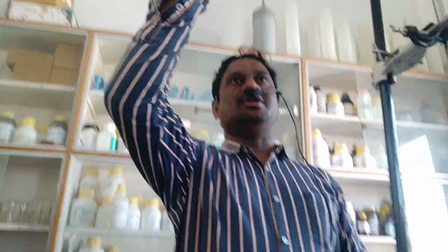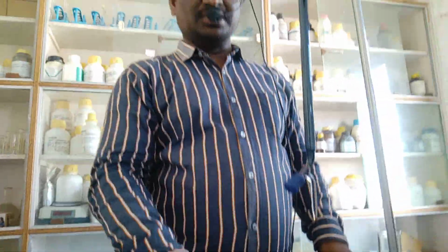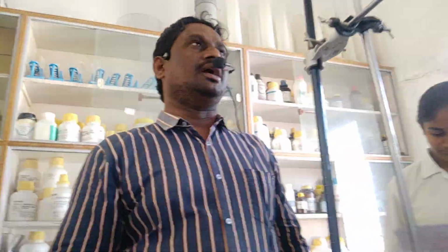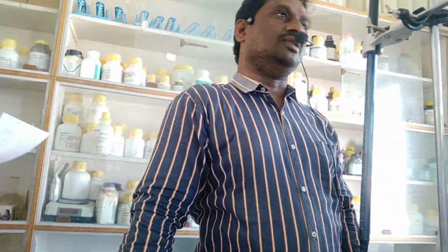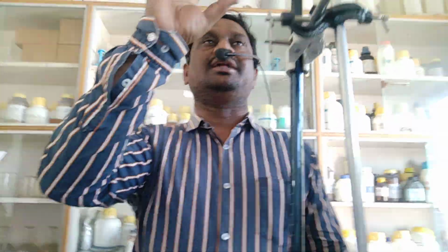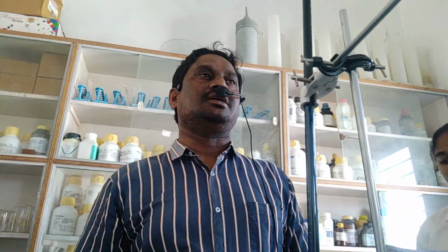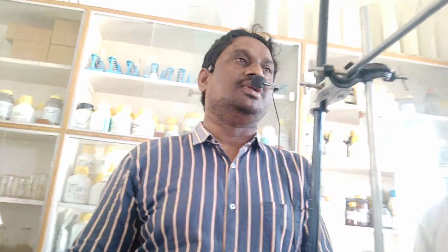Right. Next, this is the conical flask. You can observe here. In this conical flask, see the material and the procedure. What we are doing here: the experiment is to estimate the molarity of KMnO4 solution using standard FAS solution. We have to find the molarity of KMnO4 solution by titrating it against FAS. What is the meaning of FAS? FAS means ferrous ammonium sulfate.